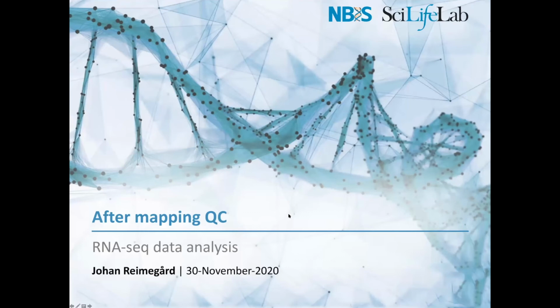genome. So we know where they are located, but we now want to figure out where they are located on the genome, and that's basically after mapping. And then there are a lot of quality measurements you can do on this mapping step, by examining where the reads are mapped based on your a priori assumptions of where they should end up.